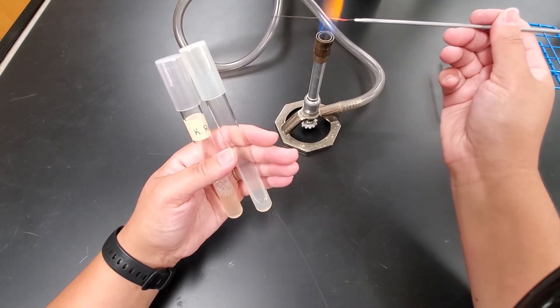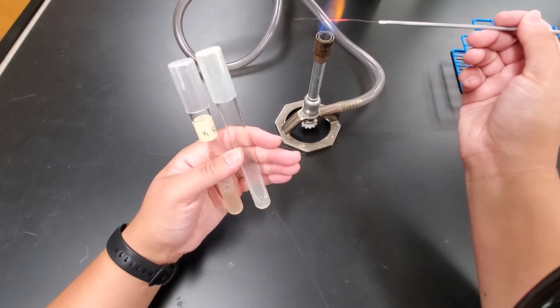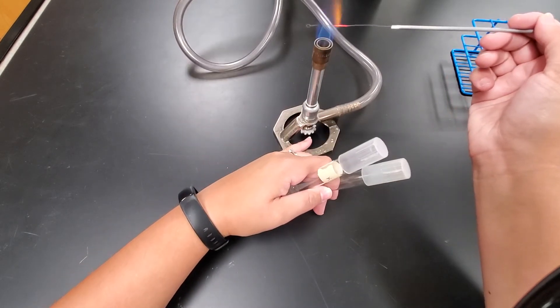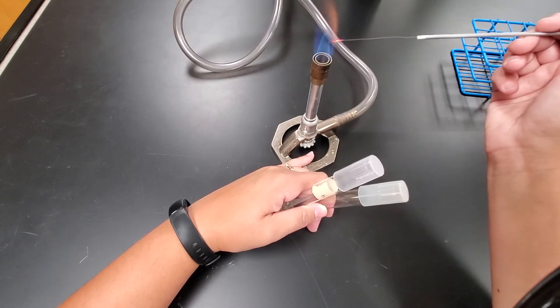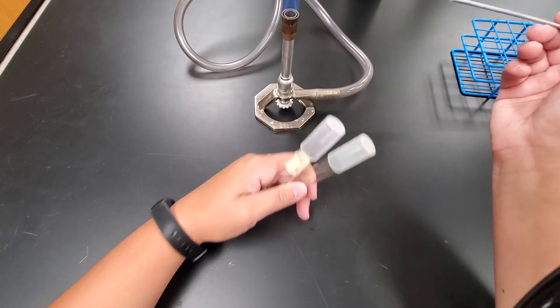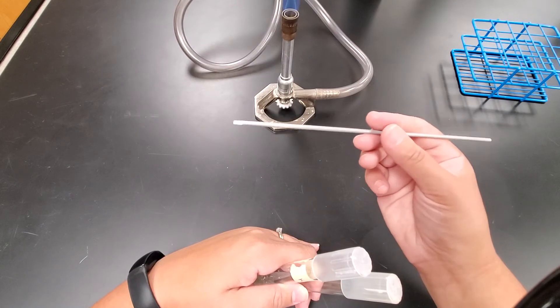So remember, whenever you flame your loop, you're going to start at the base by that handle, and you're going to move through that hottest part of the flame until you get to the tip, which is where the loop is located. So once you have that, now I'm holding this like a pencil.